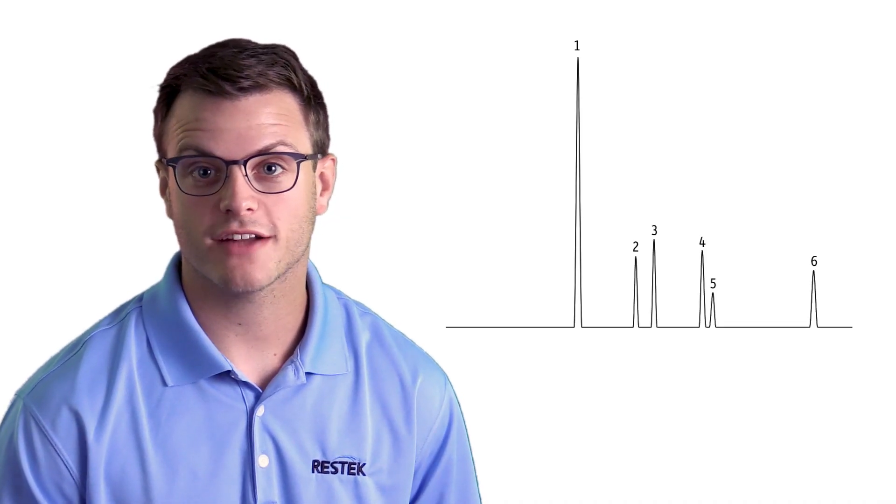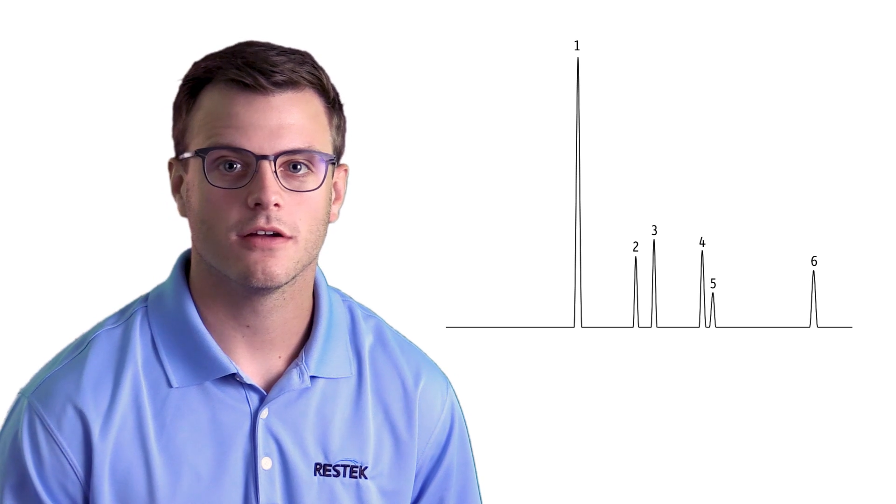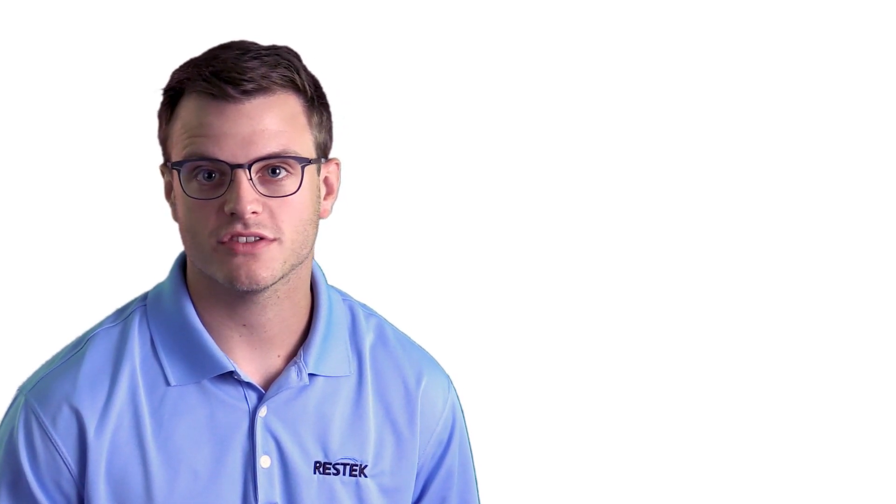Our chromatography should be back to normal or looking much better. To prevent unwanted instrument downtime before a major problem occurs, I like to put my instruments on a preventative maintenance schedule. Once you understand the sample matrix you are working with, plan ahead by setting a routine schedule for changing your inlet supplies. Keeping your inlet clean and happy will prevent frustration and give you more time for analyzing samples.